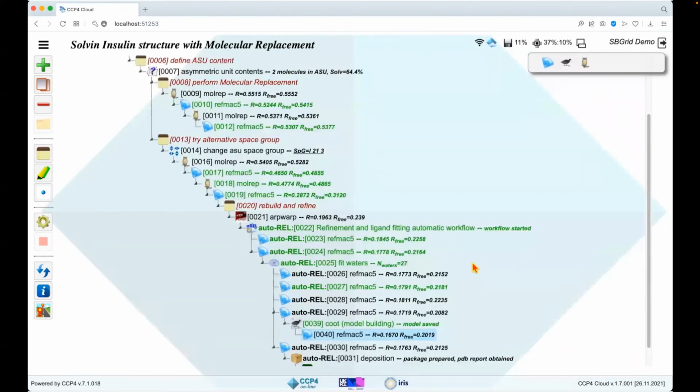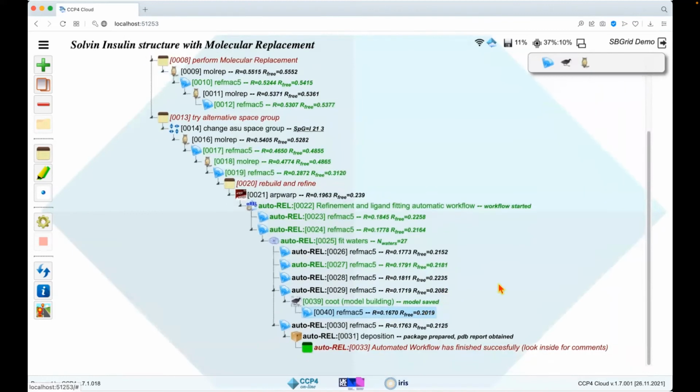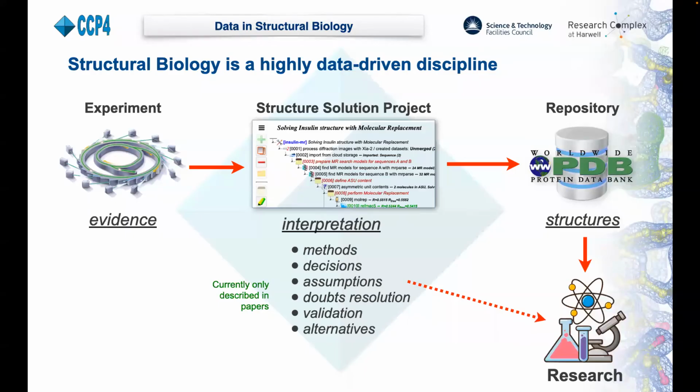Which should be done. Right. So proudly, our factors are done. Now, before I finish with this presentation, I would like to allow myself some general remarks on the subject.